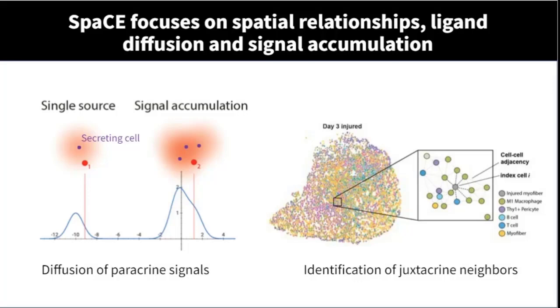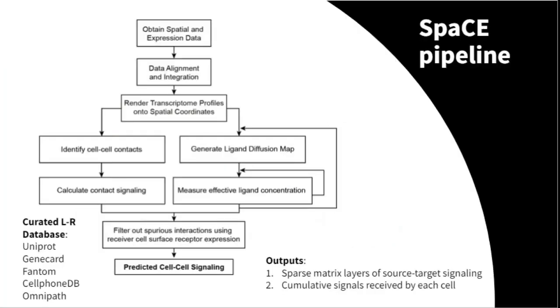And so, combining what's already been done with databases and algorithms such as CellPhoneDB and ligand-receptor interactomes, what we've actually been working on is this method of estimating ligand diffusion. This required a customization of a novel database of ligands that we can call upon to estimate diffusion constants.